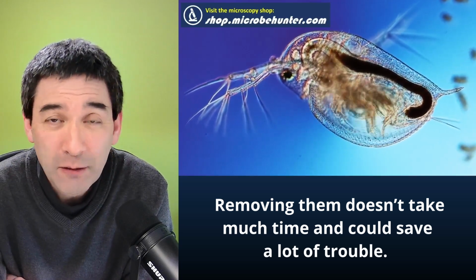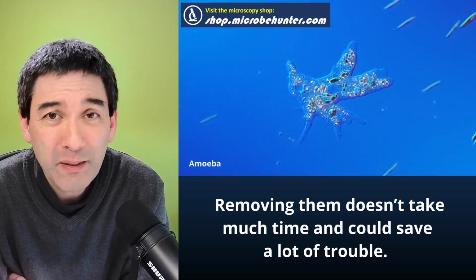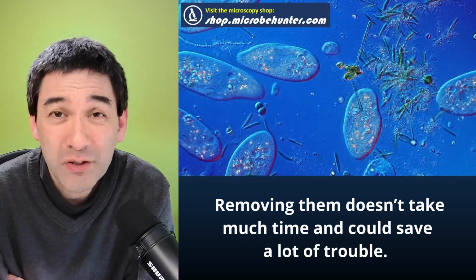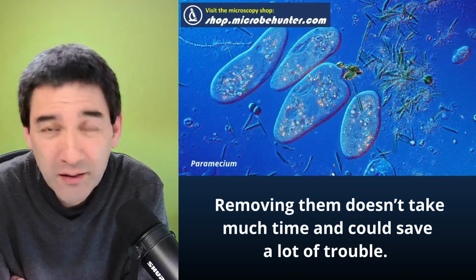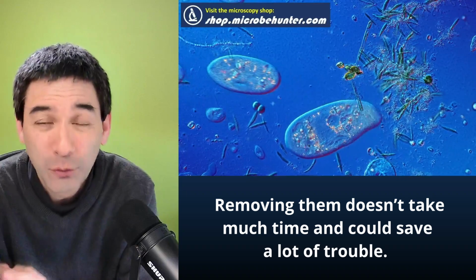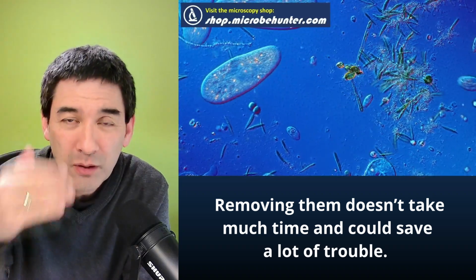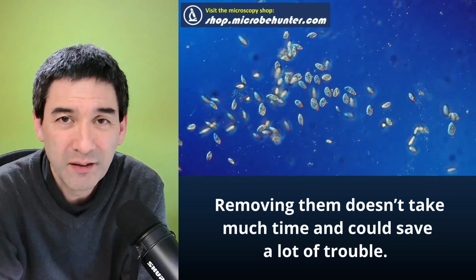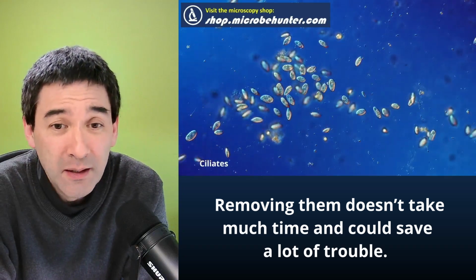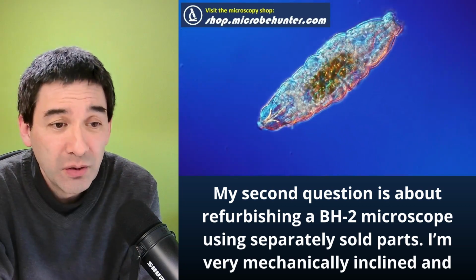One just has to be a little bit careful, but I'm just talking out of experience, especially when you're using the microscope for many hours like I'm doing, and sometimes you simply forget. I forgot once that I was using the oil immersion objective, and I simply rotated the 40 times or 60 times non-oil objective directly into the immersion oil. I completely forgot about it. This is because I'm not always looking at the side. I'm just looking through the microscope, and then I'm changing magnification, and I simply forgot about it. So this can happen quite easily. But unfortunately it's not practical.